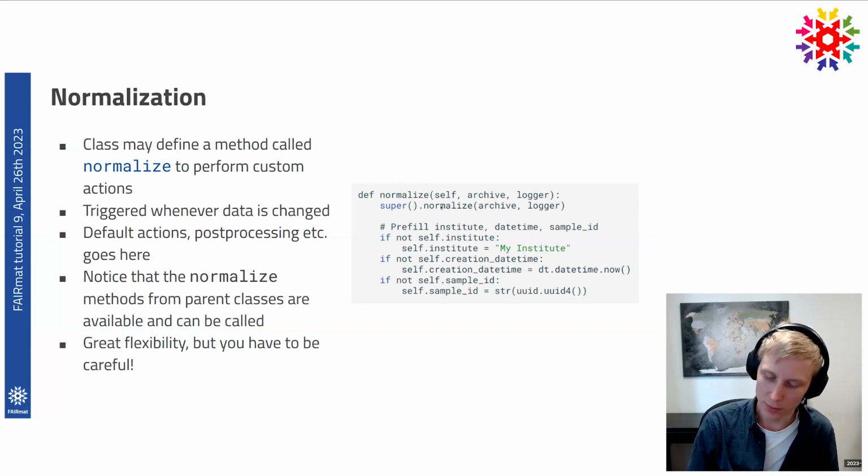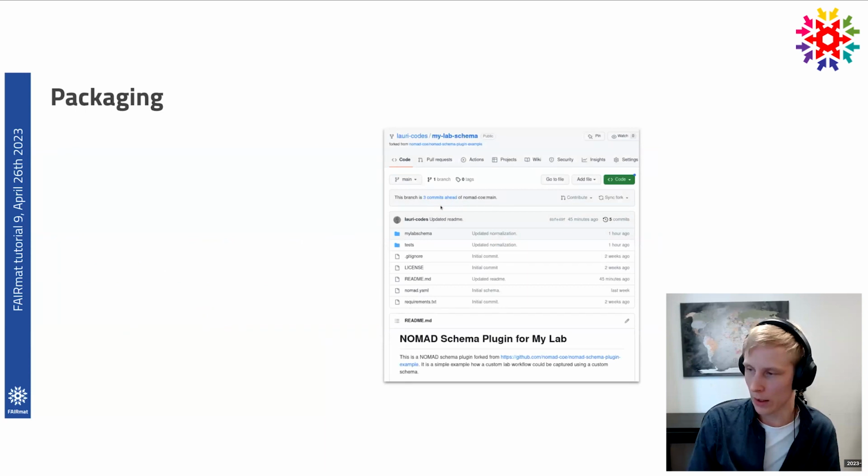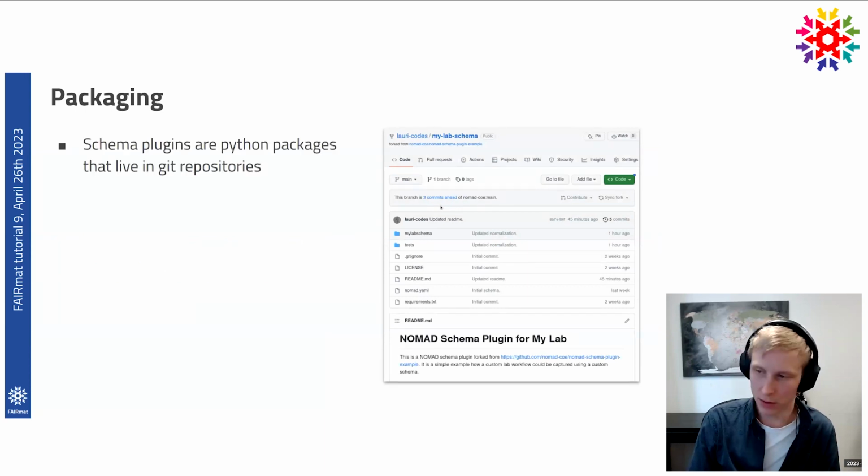are plugins, because you can run almost any kind of Python code in here. So you have to be careful that you don't accidentally remove data, overwrite data, or do anything nasty in there. There's great flexibility, but you have to be really careful as well. And as Marcus mentioned, these schemas are Python packages essentially.